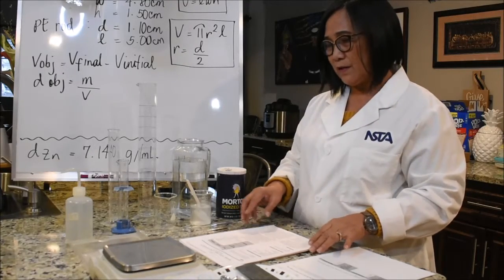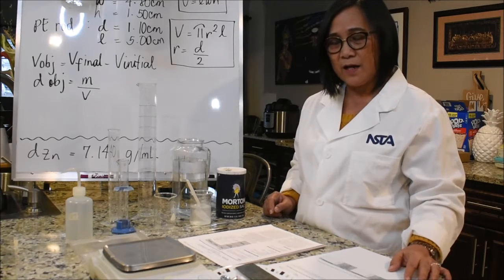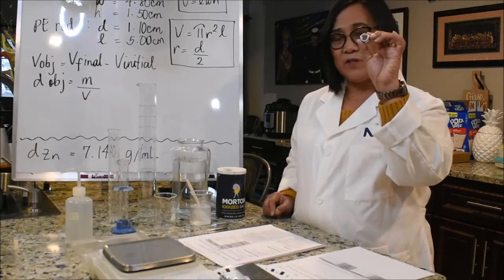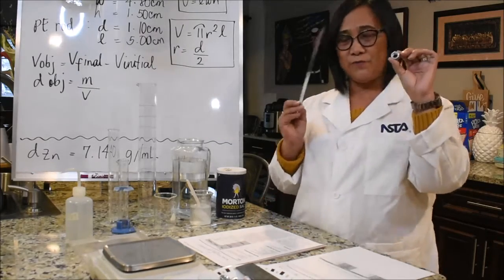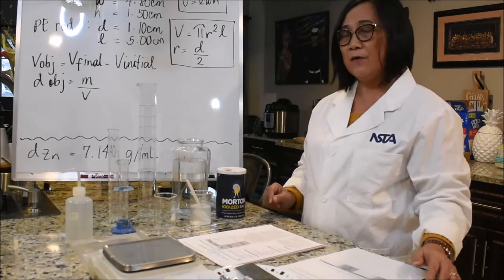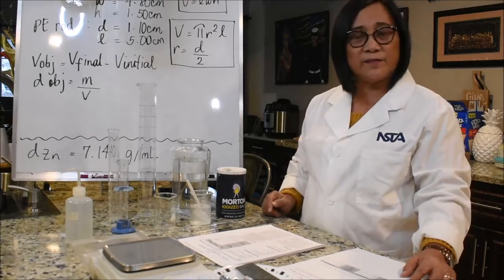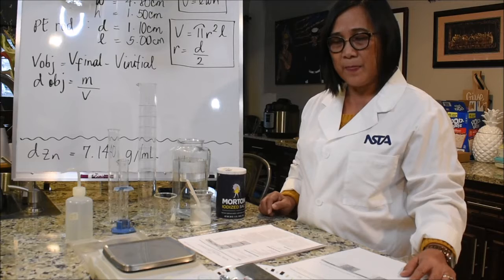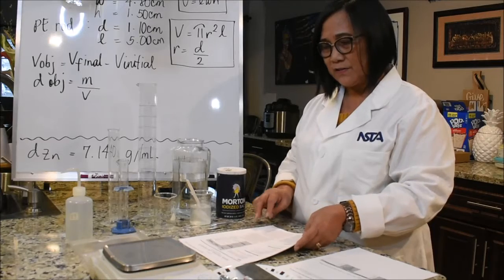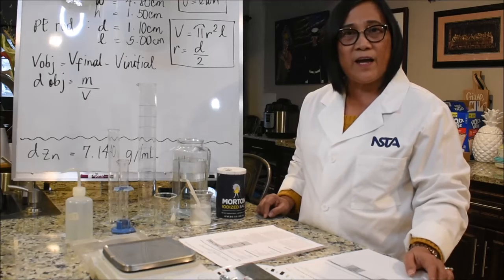And also use another method of measuring volume of objects that don't have definite shape, like for example a bolt, which we cannot use linear measure to find its volume, and therefore we will adopt Archimedes' principle of water displacement, and so we will be using a measuring tool like the graduated cylinder to find the volume of an irregularly shaped object. Now, prior to this experiment, let us just link this lesson to a previous lesson we had before when you were still doing your Canvas assignment.